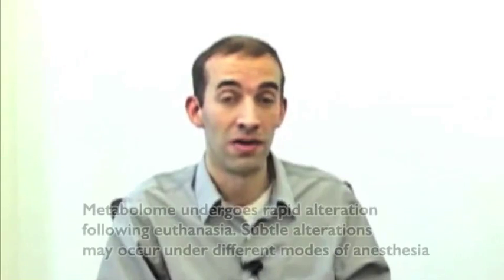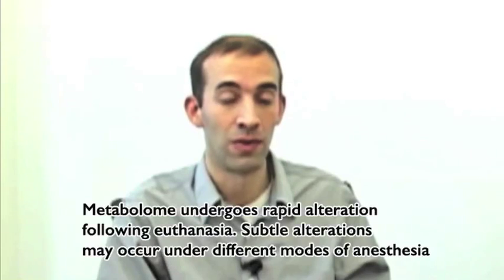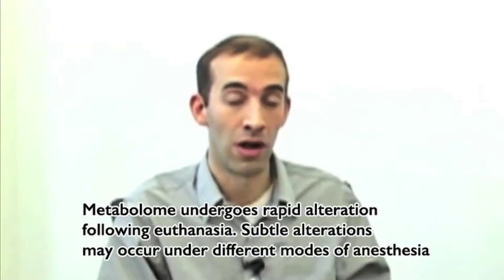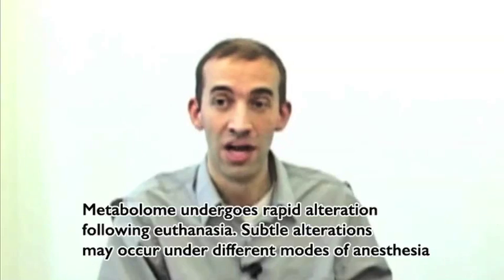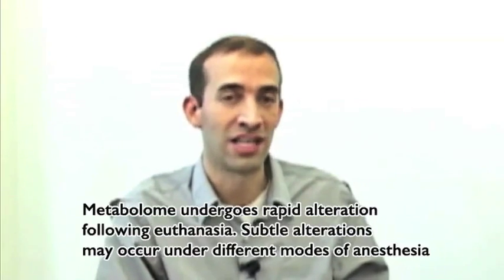The metabolome, not surprisingly perhaps, undergoes a fairly rapid and dramatic alteration following euthanasia, and also there can be more subtle alterations that occur under different modes of anesthesia. For instance, one observation that we've seen in euthanized animals, we detected threefold higher levels of the glycolytic intermediate glucose 6-phosphate in animals that were euthanized, even though tissue collection was performed very rapidly following euthanasia, compared to animals where tissue collection was performed while they were under anesthesia. We also detected many other changes in the metabolome, not limited to skeletal muscle, but also present in many other tissues and many other classes of metabolites.